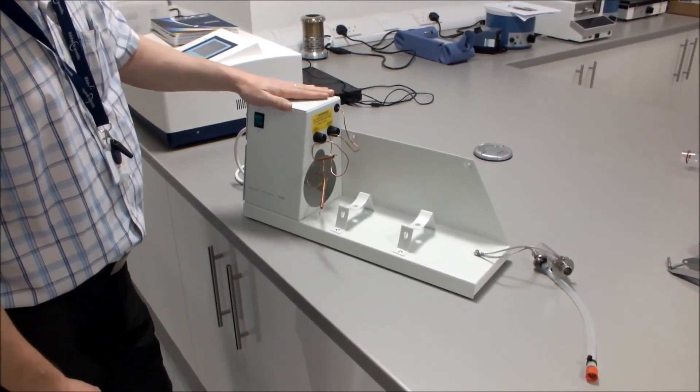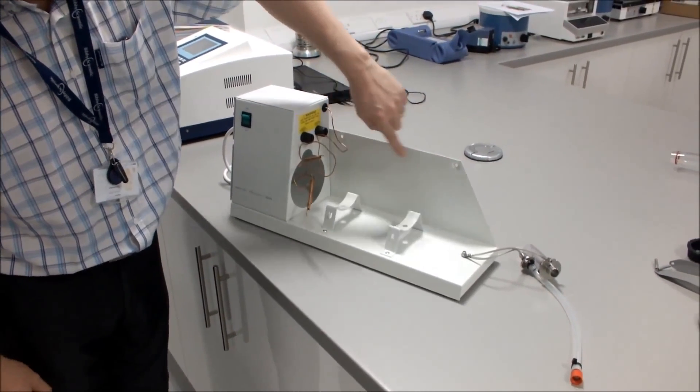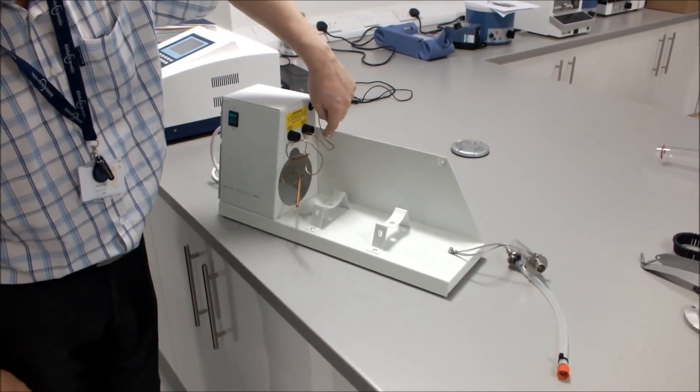Place your Distinction D4000 water still in the location where it's going to be operating. There are two holes fitted in the actual stand if you want to wall mount the unit.